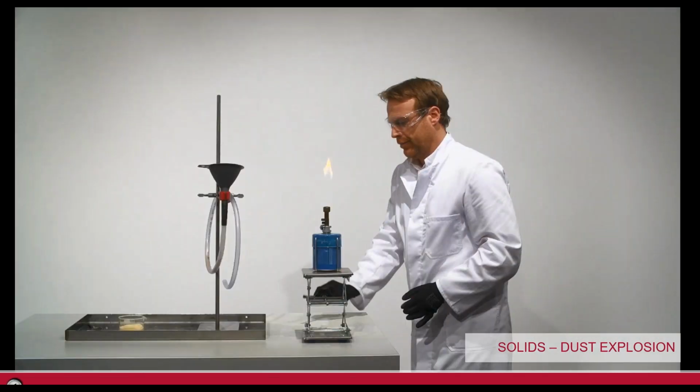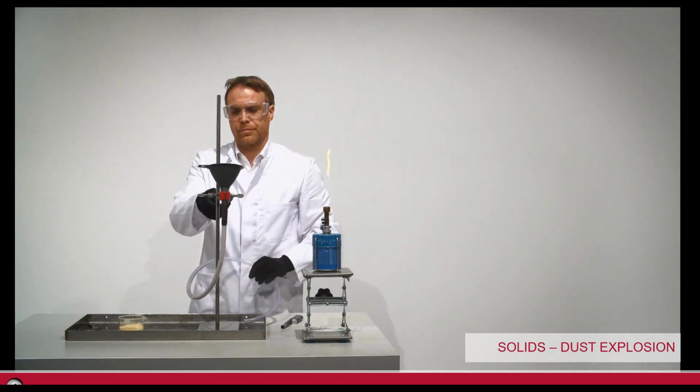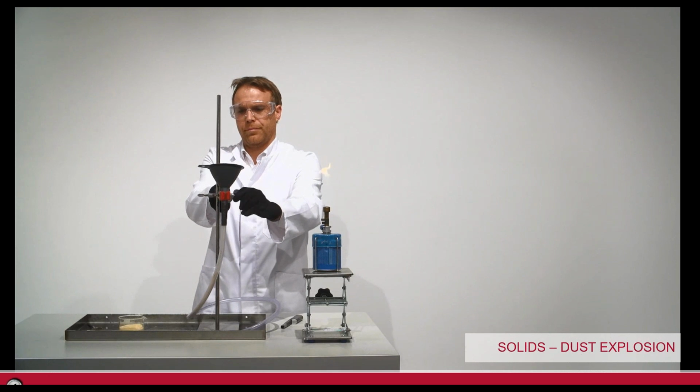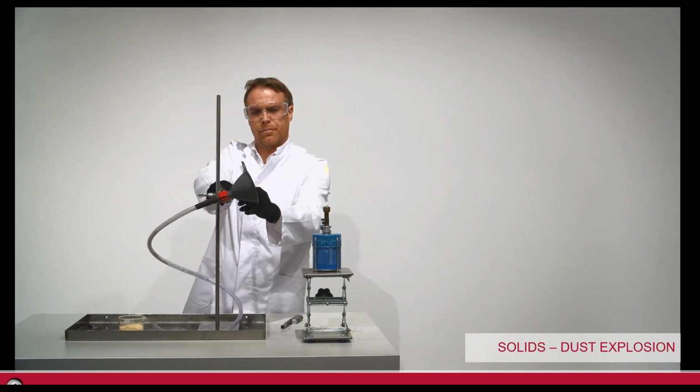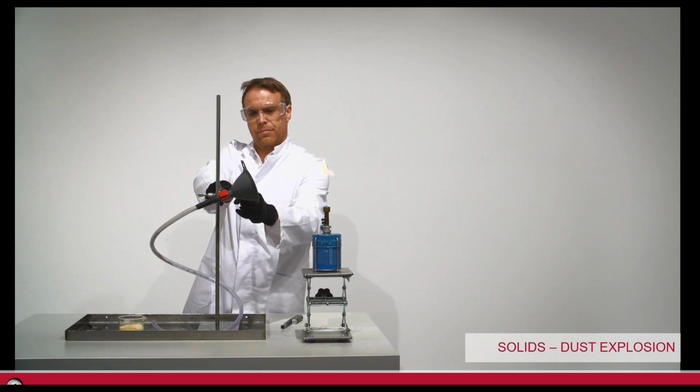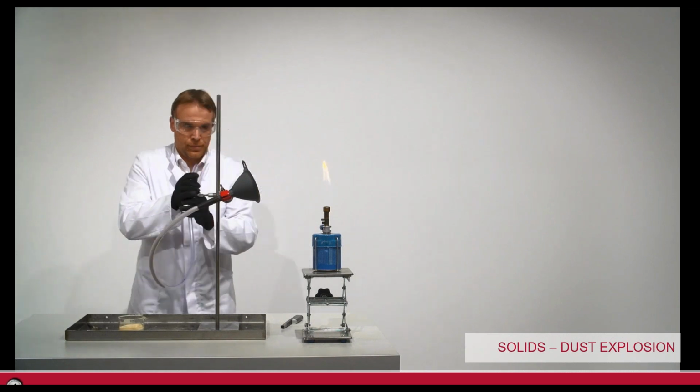In this, he's using, of course, an open flame as our ignition source. His flammable material is the solids, and oxygen or breathing air is prevalent just because he's in an open environment. Pretty cool explosion that comes off this too. The heat that comes off this is absolutely amazing as well.